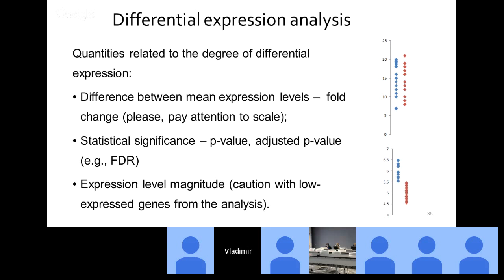It simply means that the number of people, number of tested hypotheses is so large that even events with low probability are observed. So we need to correct this standard p-value, and a correction should be aimed at considering this fact of simultaneous testing of multiple hypotheses.